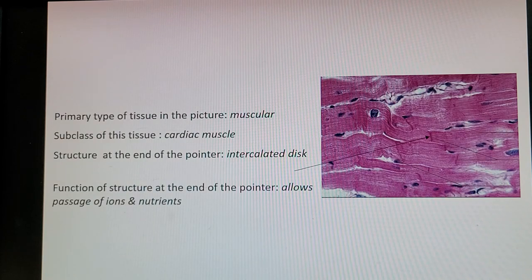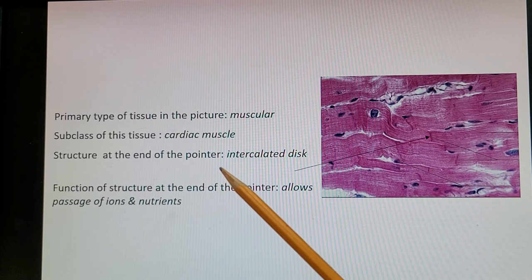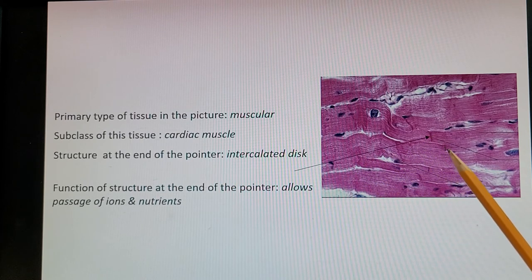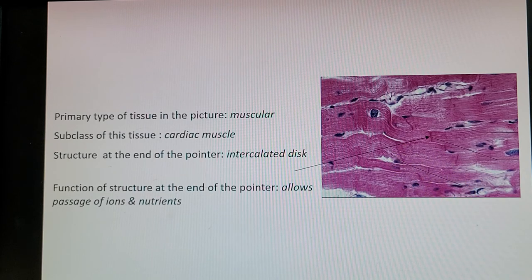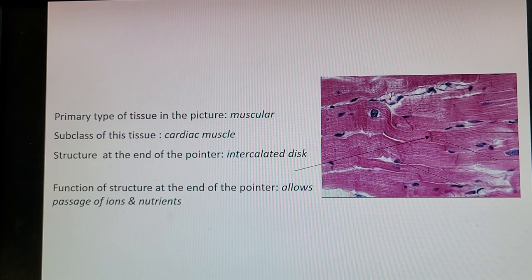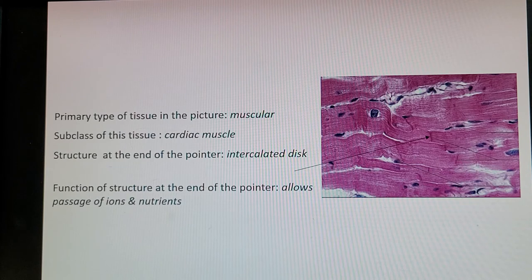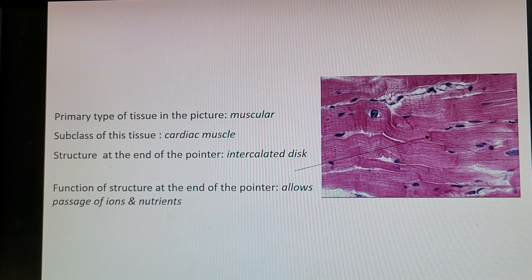Here is another muscular tissue — cardiac. We can see the striated pattern, but the distinguishing feature is the intercalated disc, the structure at the end of the pointer: lines connecting different cardiac cells. Cardiac muscle is branched and shorter than skeletal muscle, which is why you can see multiple cells bending in different directions. Cardiac muscle has one nucleus, and some cells show white glycogen storage for energy. The function of the intercalated disc is to allow passage of ions and nutrients between cells so the cardiac muscle contracts simultaneously.